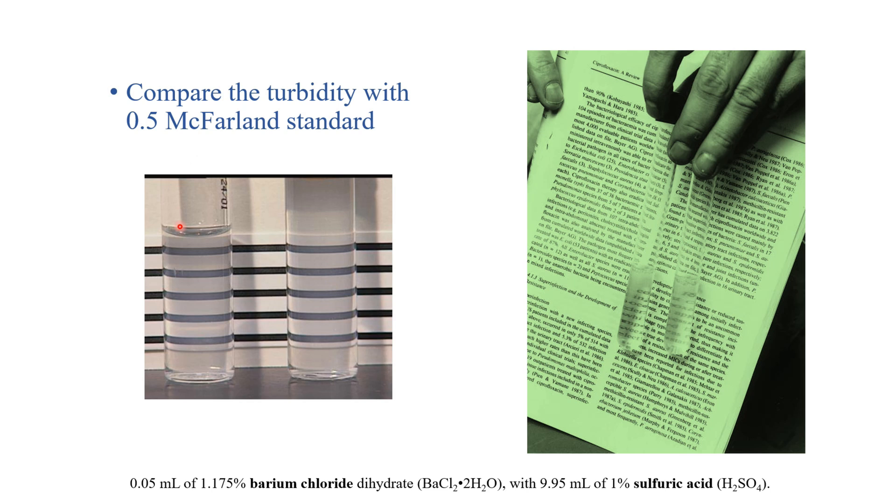So, this is our inoculum and this is the McFarland standard. This McFarland standard is a reference standard to check the turbidity or to compare the turbidity of the inoculum. So, our inoculum will be standardized by comparing this McFarland standard with our inoculum.